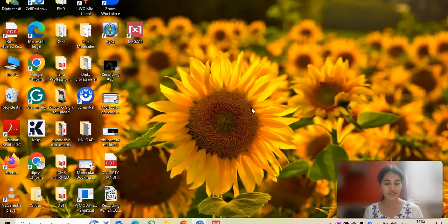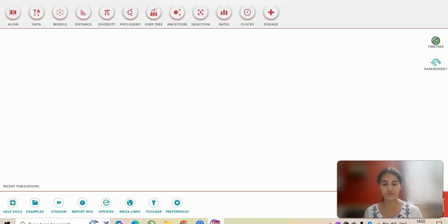Hello everyone, welcome to the video tutorial on how we are going to construct a phylogenetic tree using MEGA11 software. If you download it from your browser and install it in your system, this will be your interface for MEGA11, where MEGA stands for Molecular Evolutionary Genetic Analysis.